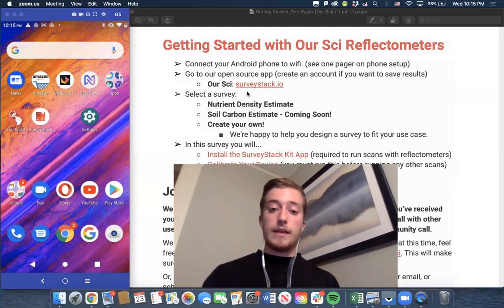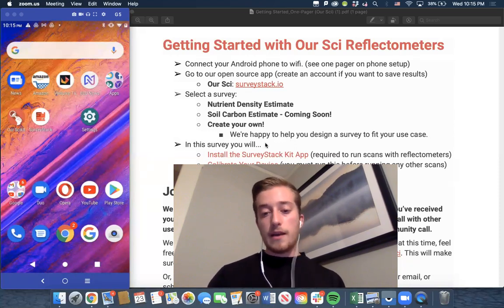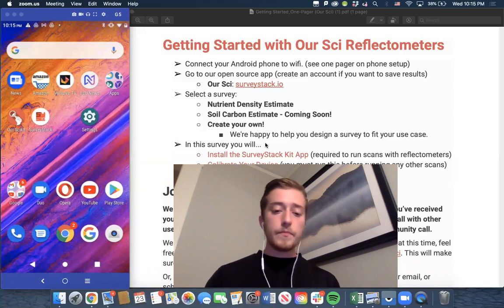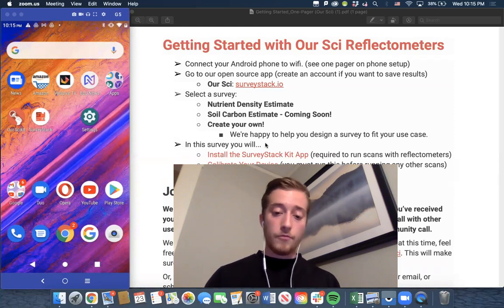And then in the same video, we will choose our survey and we will install the SurveyStack Kit app, which you only have to do one time. And it makes it so that SurveyStack can connect with your reflectometer and run measurements.